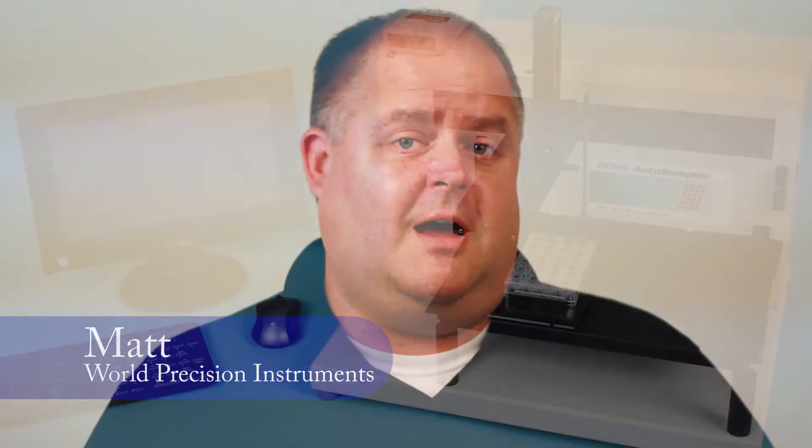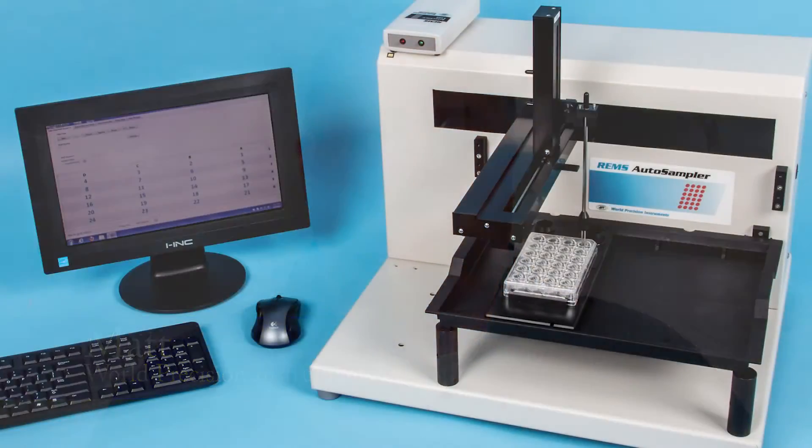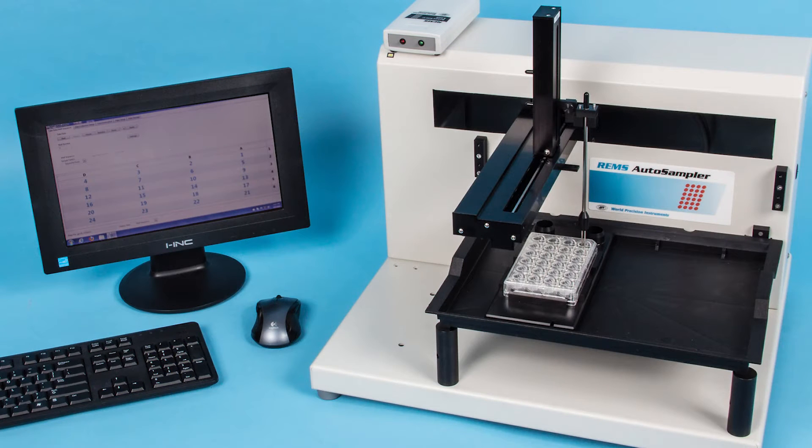Hi, I'm Matt with another WPI technique. Today we're going to talk about WPI's High Throughput Robot for Automated Tissue Resistance Measurement and the newly designed REMS software.